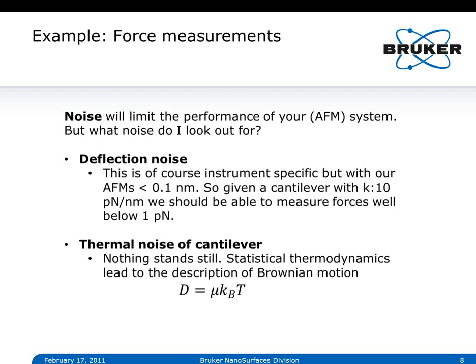Typically before they go shopping, but there's also a lot of talk about noise once people have the AFM. But what noise do I actually have to look out for when I want to do these force measurements? So there are basically two types. There's noise that is related to your AFM system in itself, and then there's of course noise that is related to the cantilever that you choose.